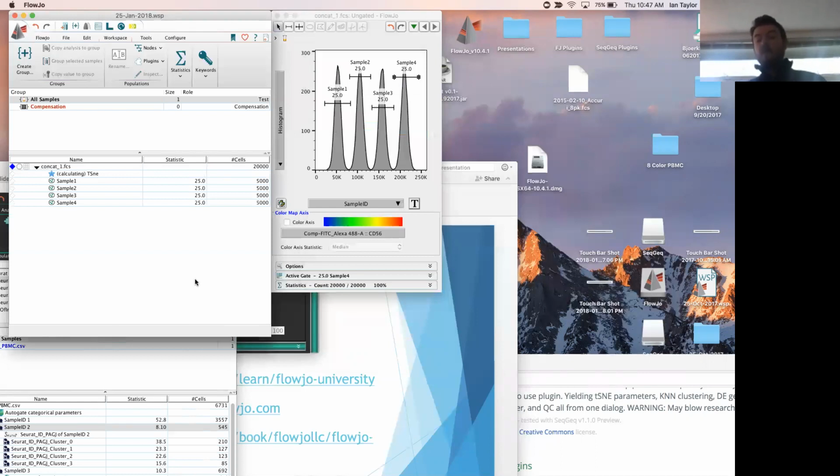So what we're going to wind up with is a set of t-SNE parameters that are in common for all of the samples. And that's getting to your question, because what we can do then is compare what the t-SNE maps were for each of the samples. Spoiler alert, basically these samples are very similar. They're run in the same plate with the same treatment with the same cells. So we're almost expecting to see this be a very unbiased t-SNE based on samples.